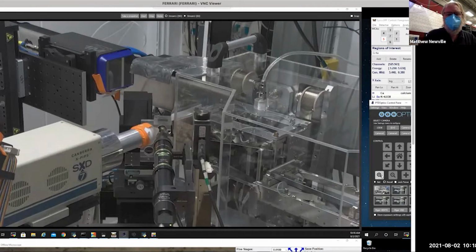Most of the work we do at this beamline is just in fluorescence. Today we're going to be using transmission, which is a little weird. For transmission, we have an ion chamber downstream, just under this detector. This is a detector that we use for X-ray diffraction, when we do X-ray diffraction. And underneath that is another ion chamber filled with nitrogen that we'll use for transmission. Really, it's there, you just can't see it in this view. If you could go in the hutch, you'd see it easily.